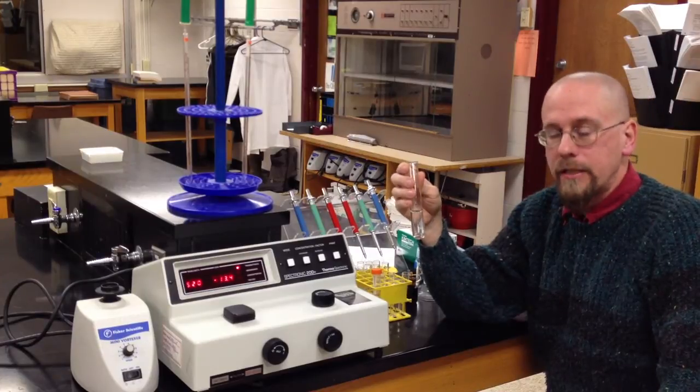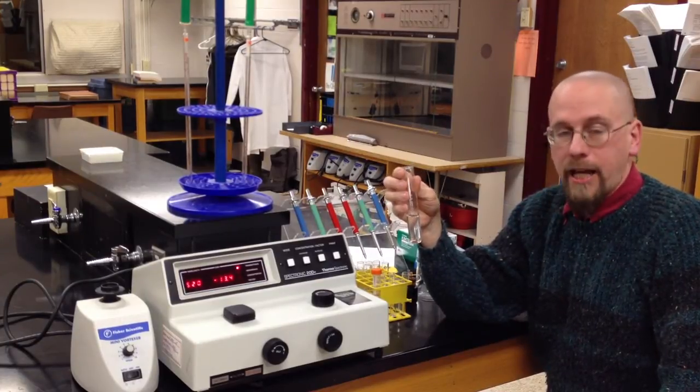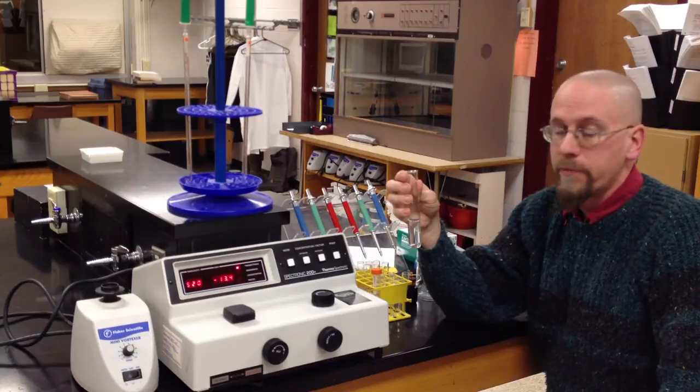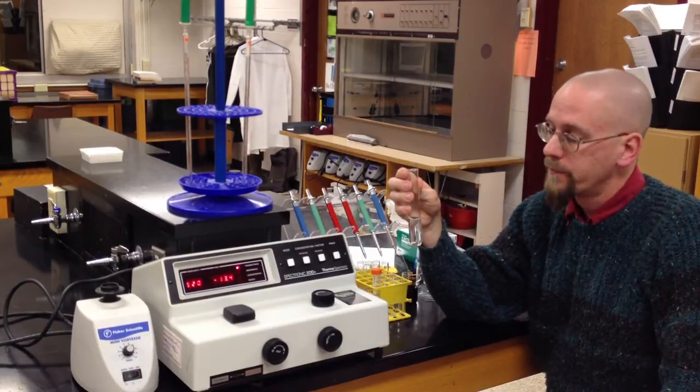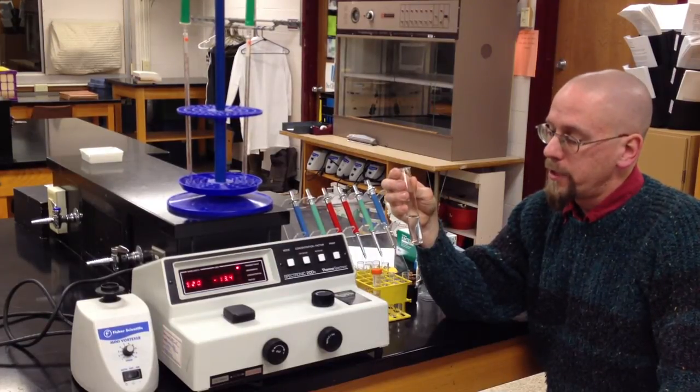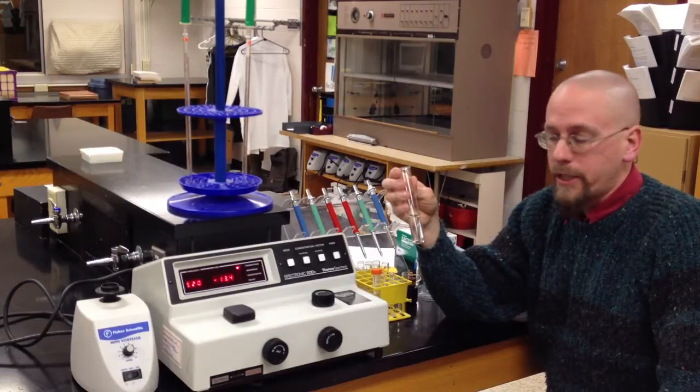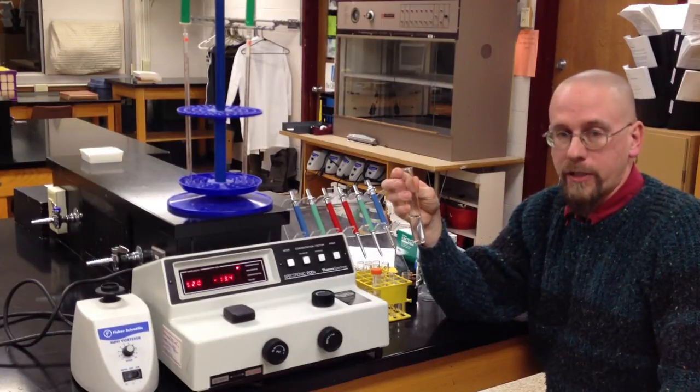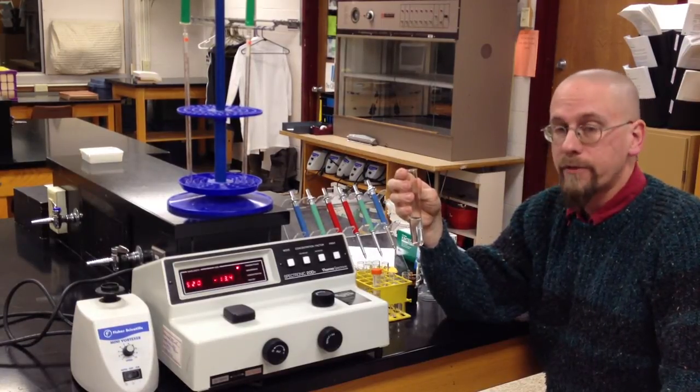What we are going to do is establish a protocol where we can measure how fast that happens and determine the effects of experimental variables on that rate of reaction.